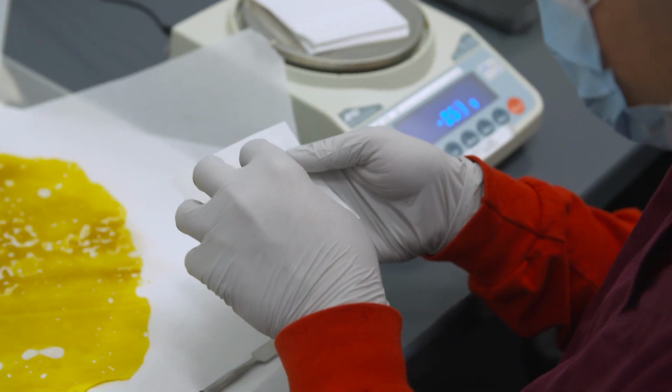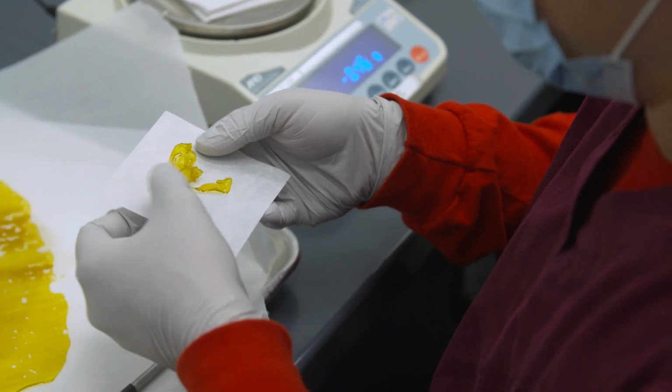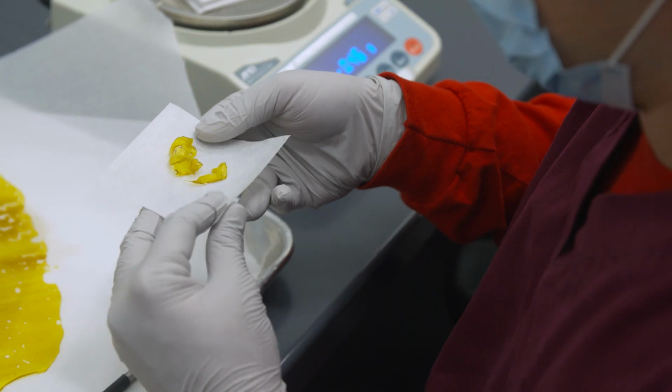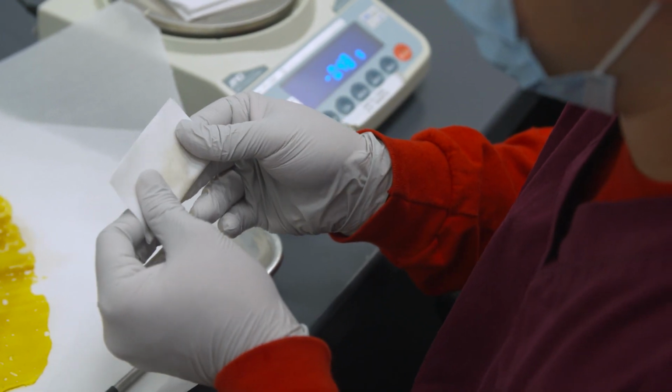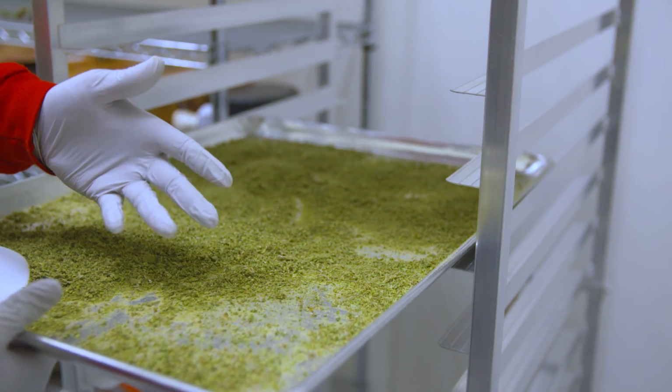So now the winterization process was originally coined for use in the vegetable oil industry, where they took vegetable oil and chilled it and removed the solid fraction. That was so-called winterized oil. So this applied to the cannabis industry is going to be the process by which waxes and fats are removed from the extract from the cannabis plant.